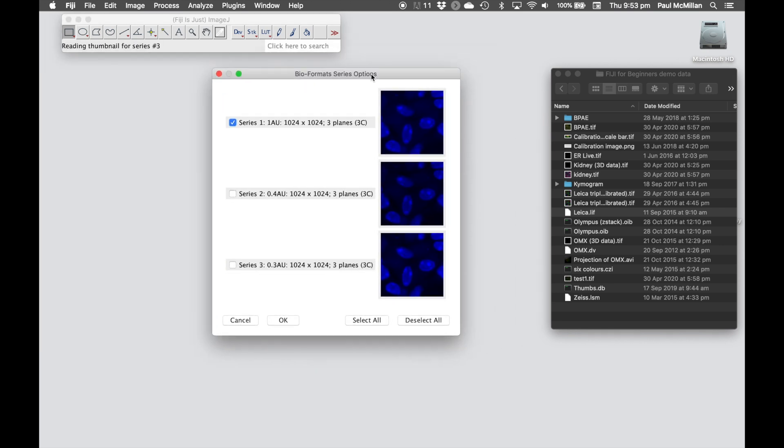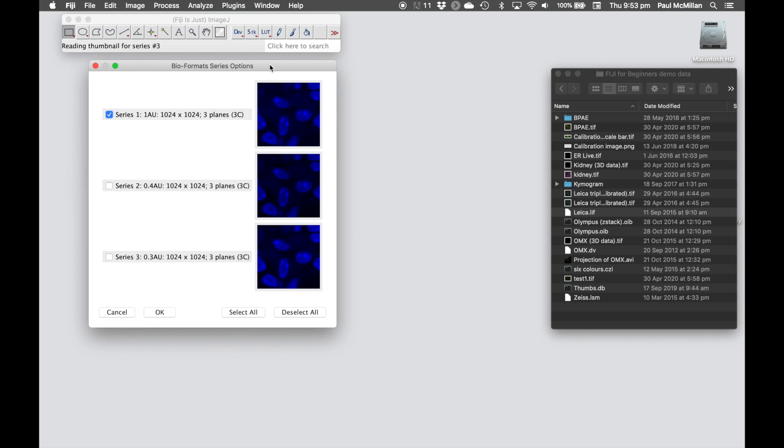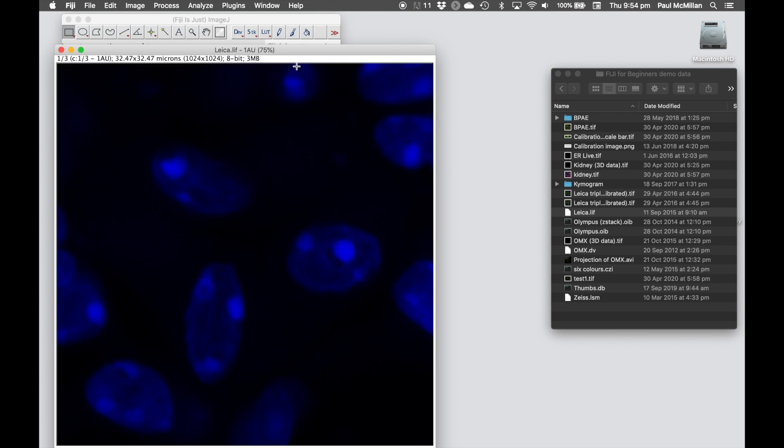Now with the Leica files, we can have multiple images within one file. In this case, we've got three different images and they all have three channels and they're all 1024 by 1024 pixels. We can select the ones we want and go ahead and click OK.